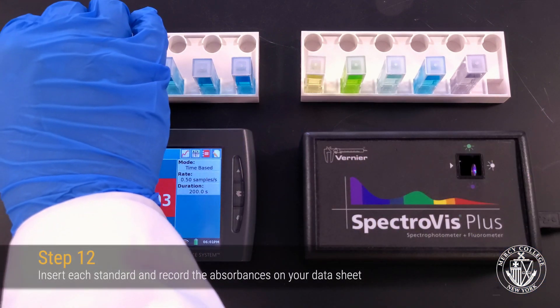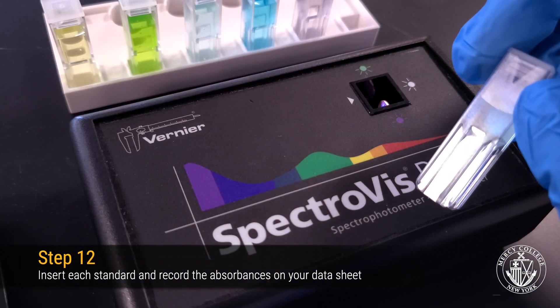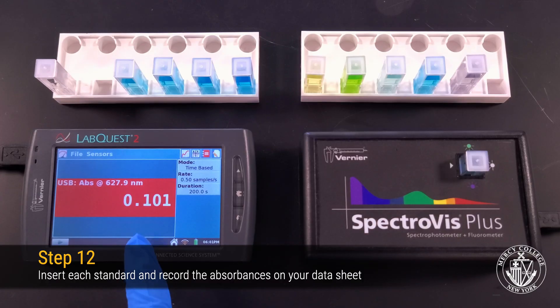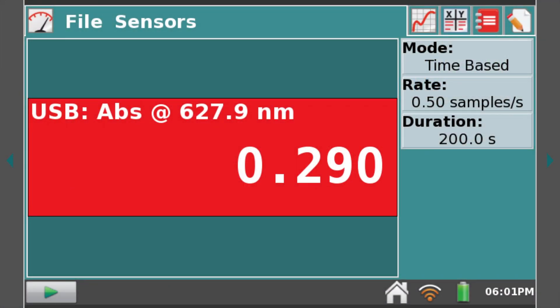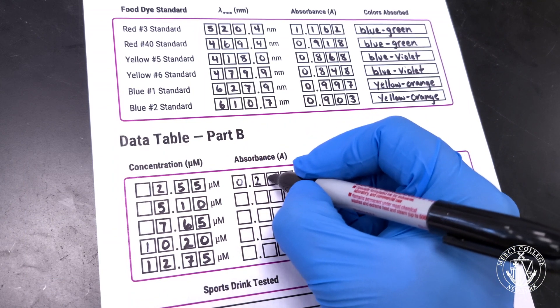Remove the blank and insert your most dilute standard to analyze first. Wait a few seconds for the absorbance reading to stabilize and record the value on your datasheet. Our first standard appears to have an absorbance of 0.289.